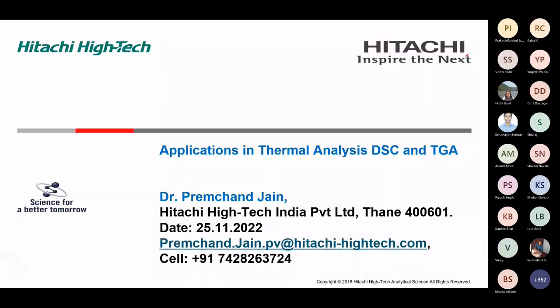So, good afternoon, everyone. Thank you, madam, for the very nice introduction. And without wasting much of time, today we shall be discussing applications of thermal analysis, particularly DSC and TGA, in various fields.